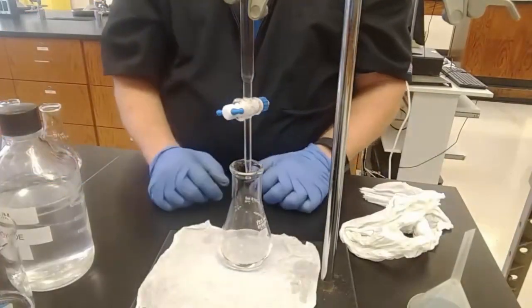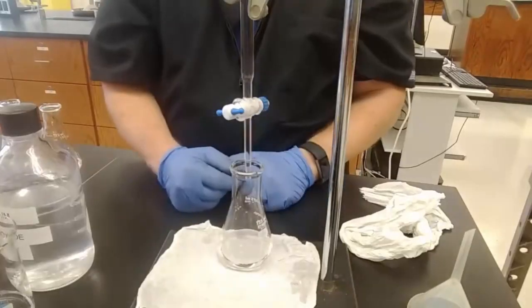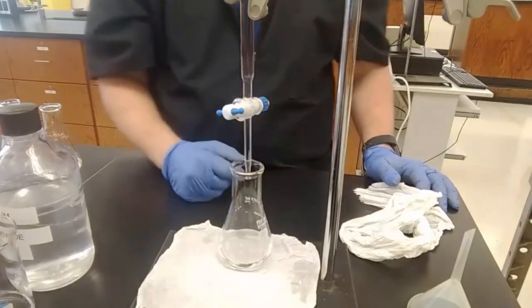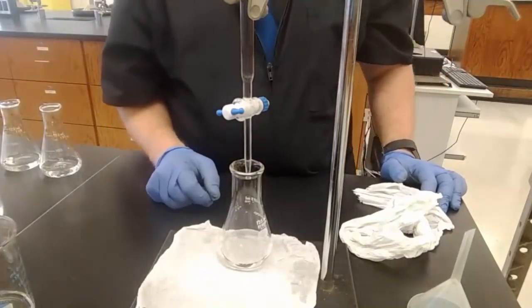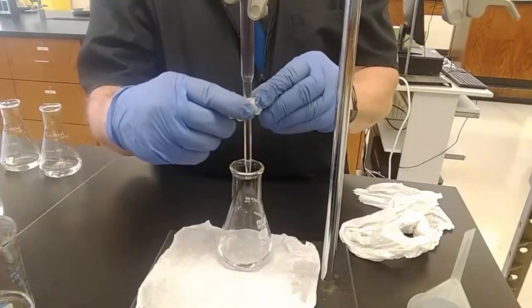Why do we use a white sheet of paper? So that we can see when our indicator changes color. All right, we have no idea where this is going to change color the first time. When we do number 2 and number 3, we will know because we will have done it once, right? We'll know how many milliliters it takes. So we're starting at 3.00 and we're going to add some base.